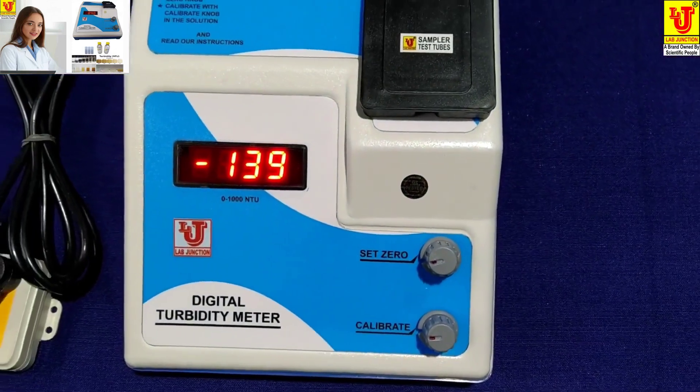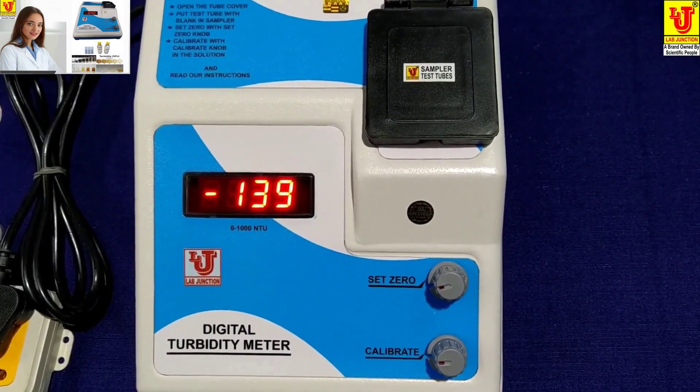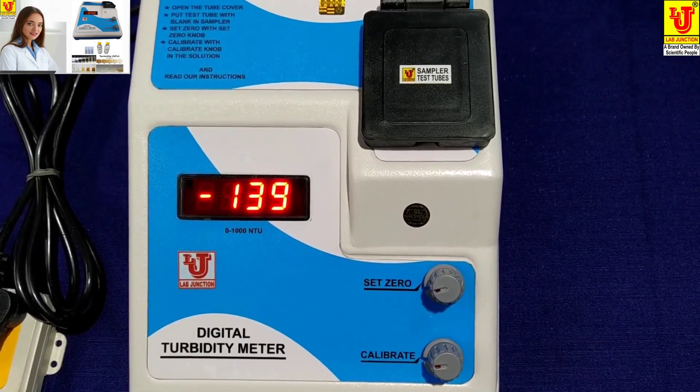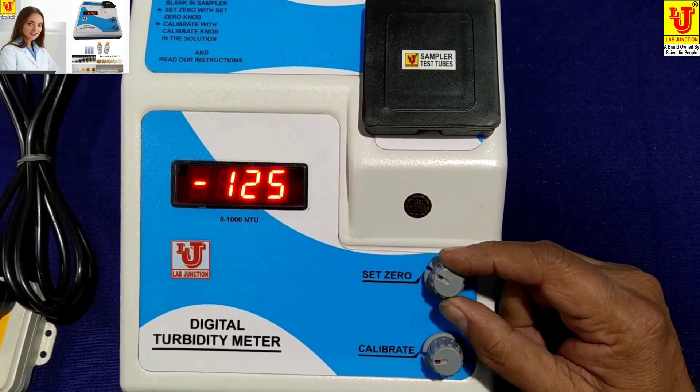My blank is distilled water. If you have your own blank, then you can use that. I am using distilled water as the blank. Now you have to set zero using the Set 0 control.